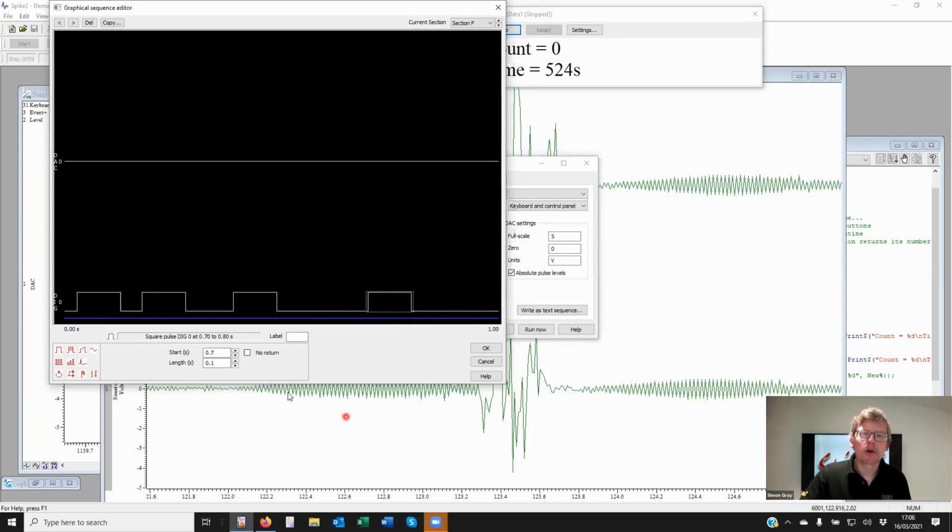So I'm describing, very roughly, a train of pulses with differing intervals. It would be much simpler to have a script load the text sequencer at this point with the times or delays between those pulses that you want to play out. But you could, with care, do what you want with the graphical sequencer here. I'm just trying to think whether I could do that a little more with the variable arithmetic. But that's the way I would go.